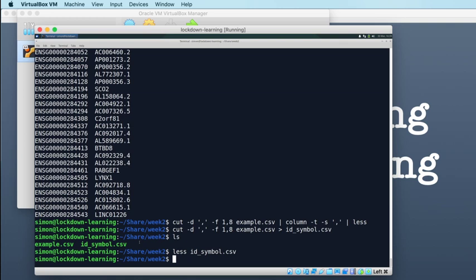The purpose of file extensions is really for your information, for letting you know what kind of file this is. So it's more convenience than anything else, but it can be good to get into the habit of naming files according to their contents. The other thing is you'll notice that I put an underscore in the file name for the file that I just created.